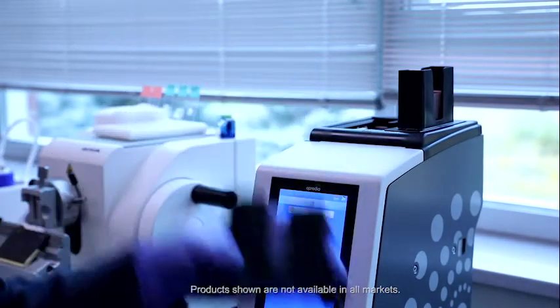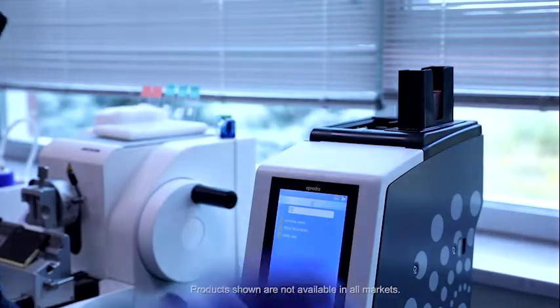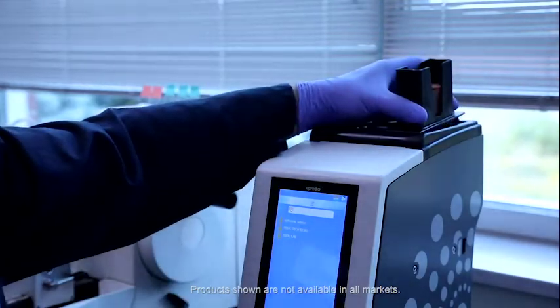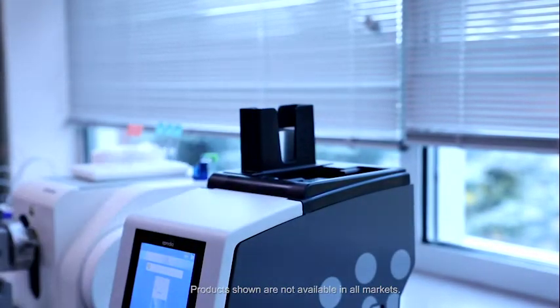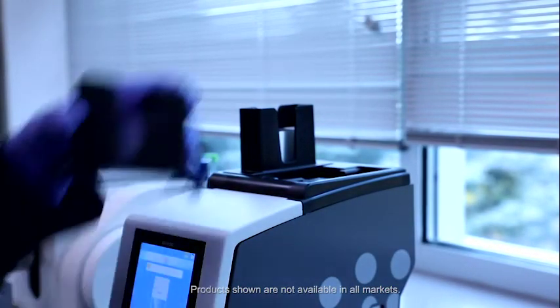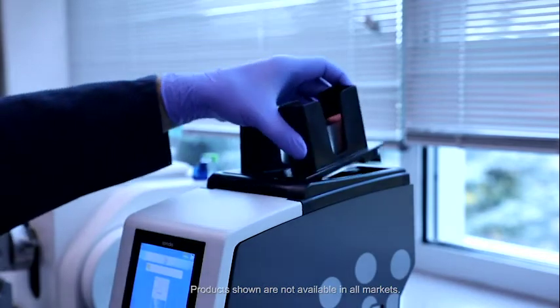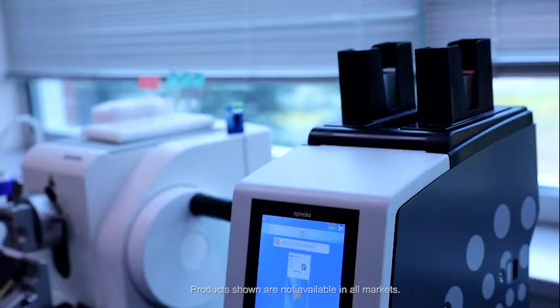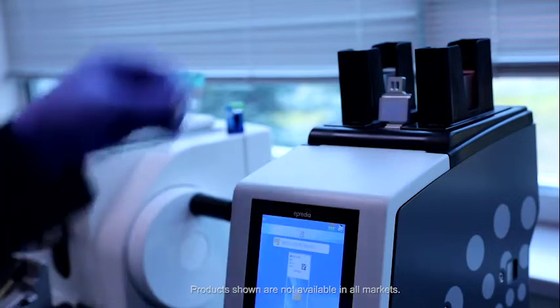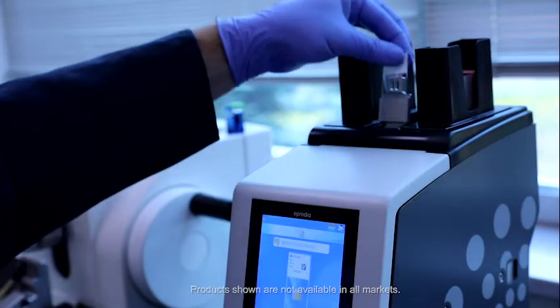Avoid downtime inherent to changing slide hoppers throughout the day. The SlideMate Pro Dual Hopper System is designed to accommodate multiple slide types. There's even a third manual feed option for greater efficiency.